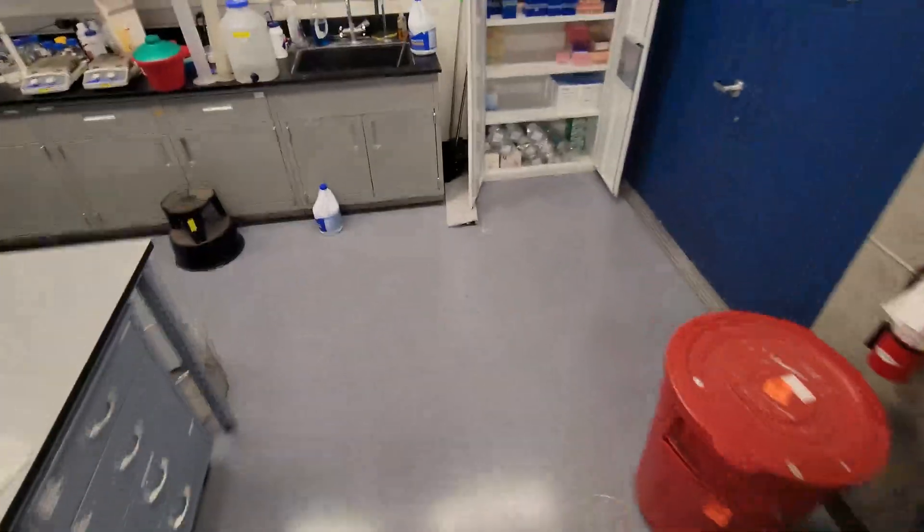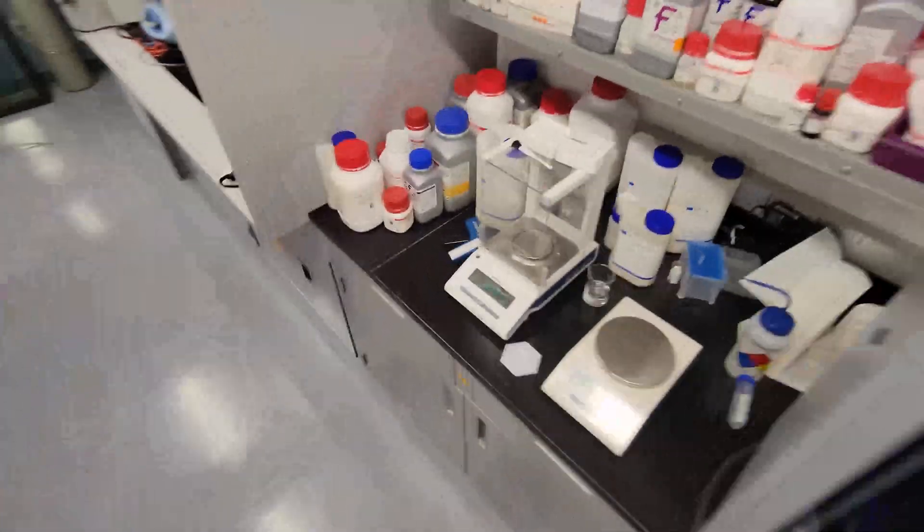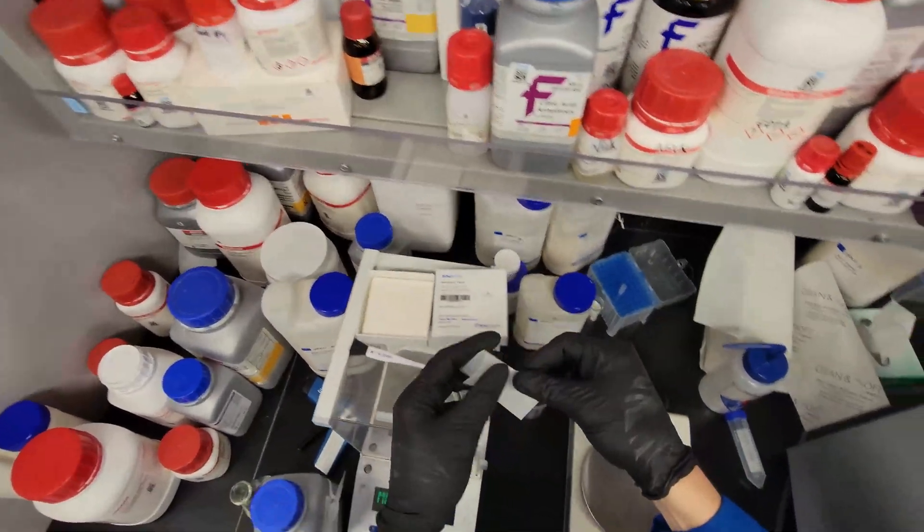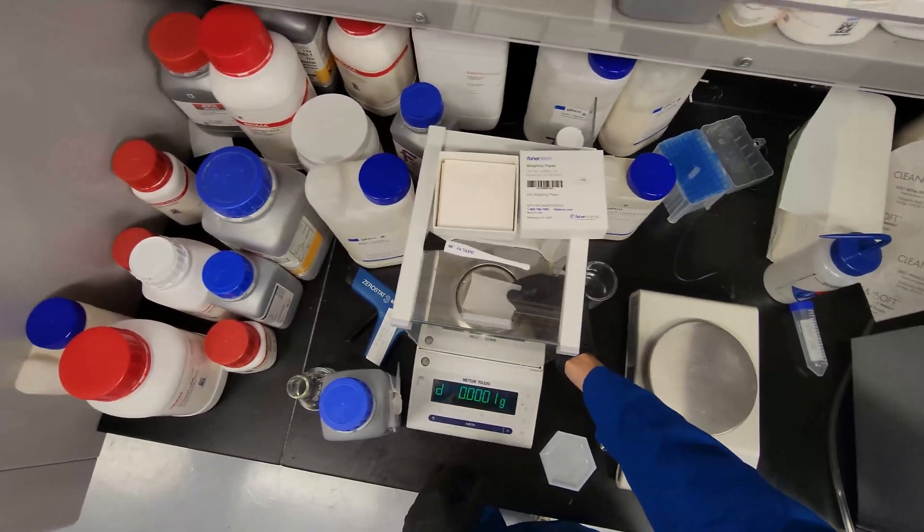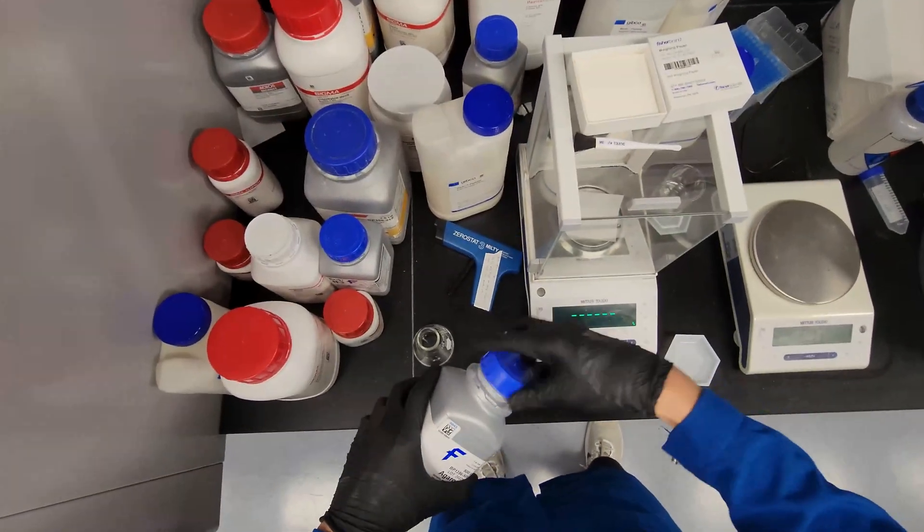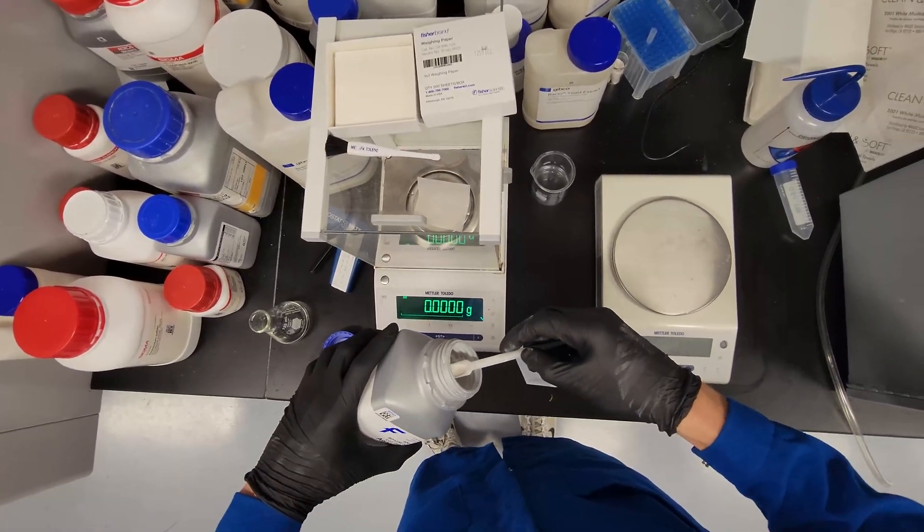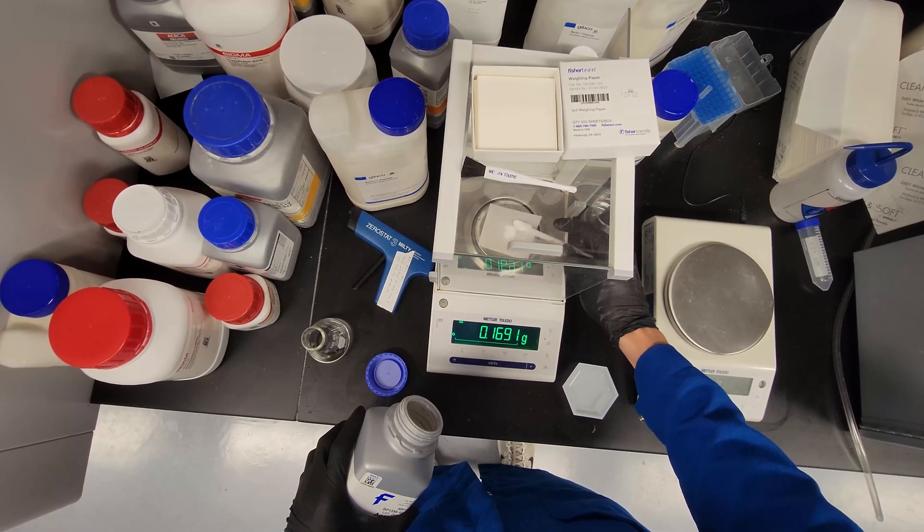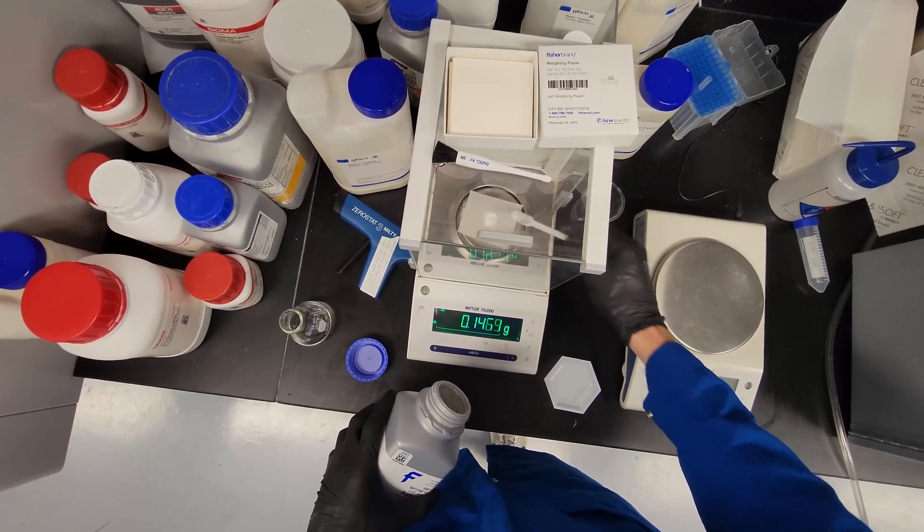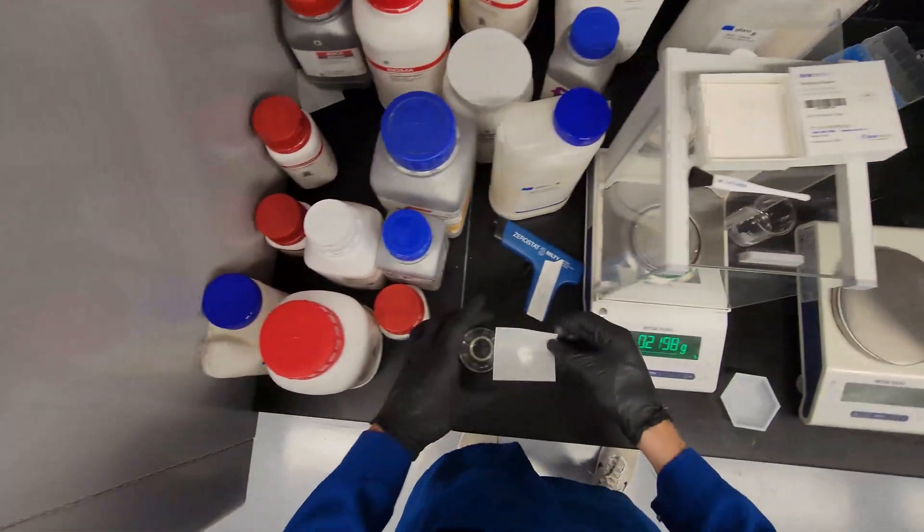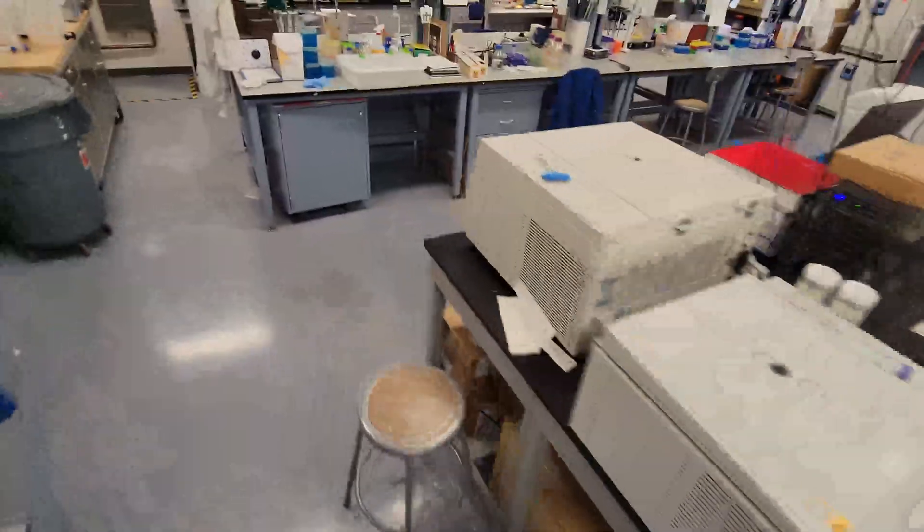Z-Buffer has beta-mercaptoethanol in it, too. This Z-Buffer does not, because we add the beta-mercaptoethanol later. So, now we need 150 milligrams of the agarose. Agarose, not agar. 150. It's a little heavy. That's better. And we'll microwave it for, let's make up a fun number, 29 seconds. Should be good.